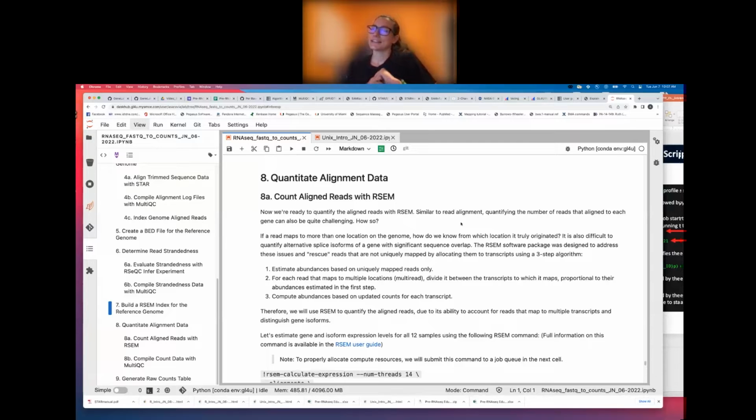No one wants to answer? The answer's right there in the notebook. Why is it challenging to quantitate our aligned reads? No one wants to tell me?